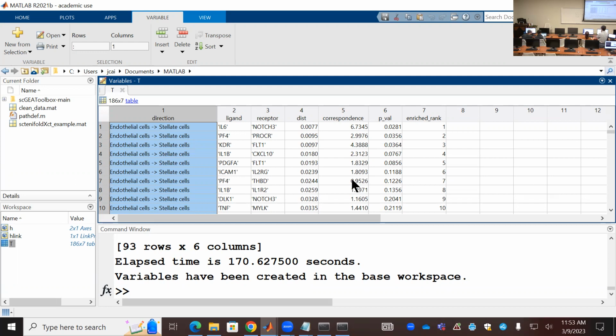Maybe I should give a function that allows you to set up your own customized database. Oh, I cannot, because that's in Python. So you just have to provide this function. What I have here is just an interface that allows you to give the cells to the Python program and come back with this table. So what the Python is doing over there, Yongjian controls it.